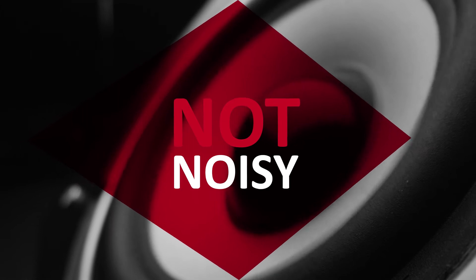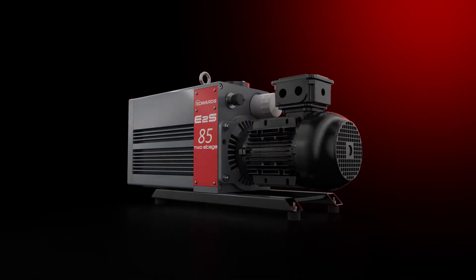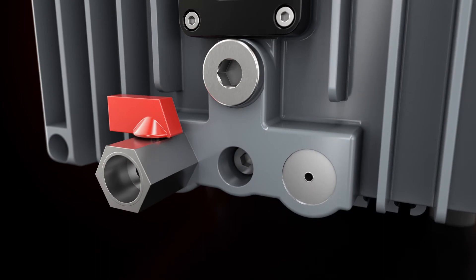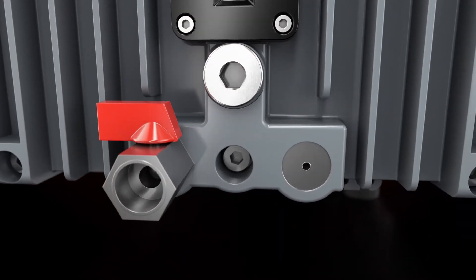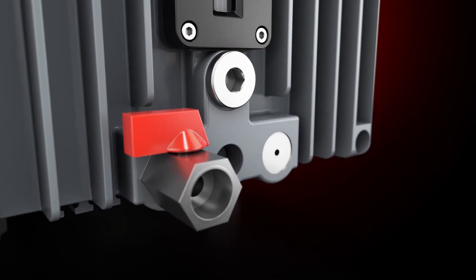And forget about sound pollution as well — this is not a noisy pump. You won't be kept in the dark either. It's easy to monitor this pump. The accessory plates can support a temperature switch and an oil level switch, helping you detect and prevent possible failures.